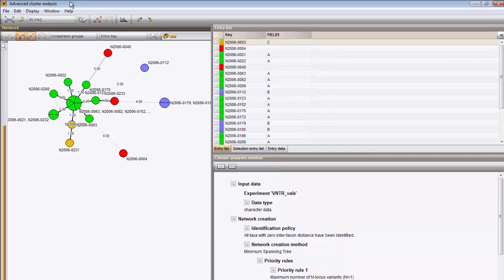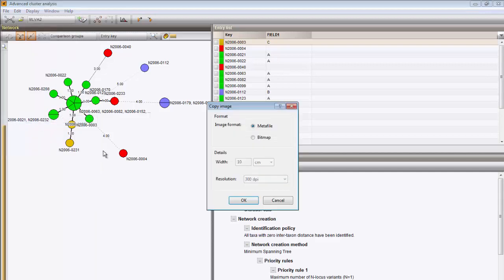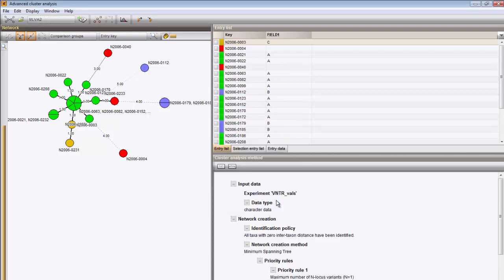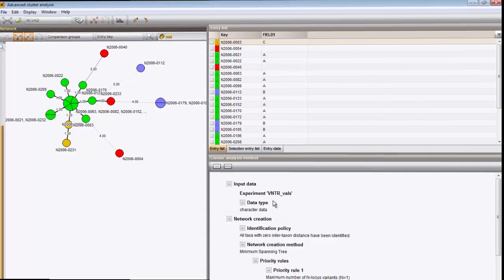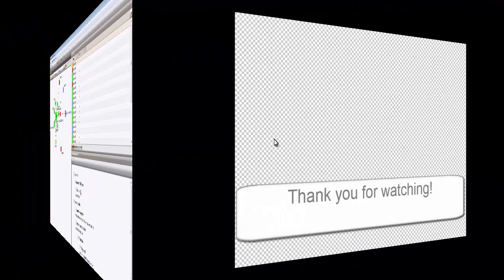The image can be copied to the clipboard as metafile or bitmap and pasted in another application. There we go.